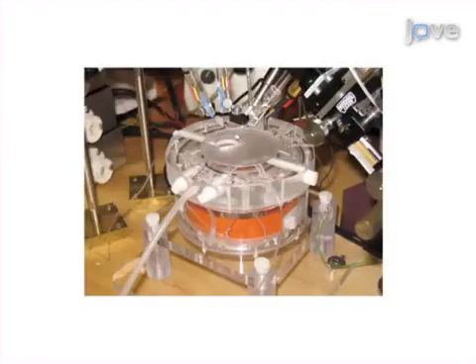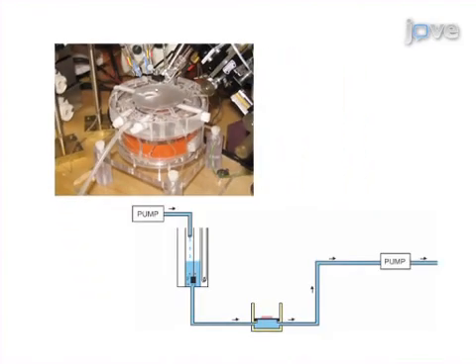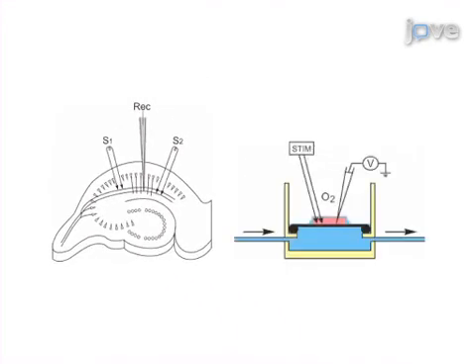Next, the slice is placed in the interface recording chamber which will be perfused with oxygenated artificial cerebrospinal fluid. The final step is to place the electrodes and record the synaptic activity in the CA1 region of the hippocampus.